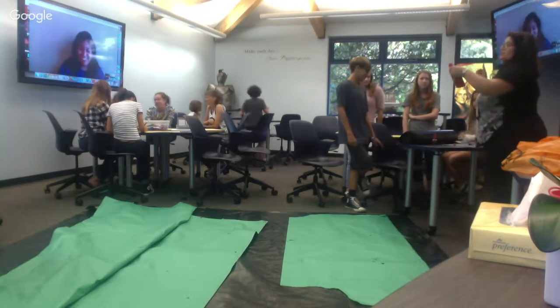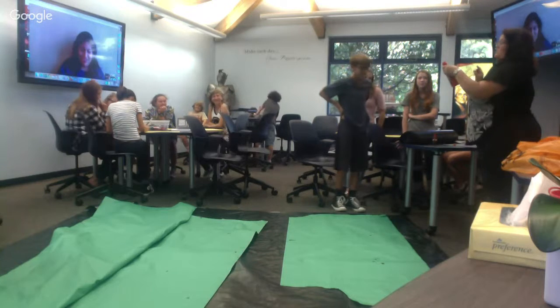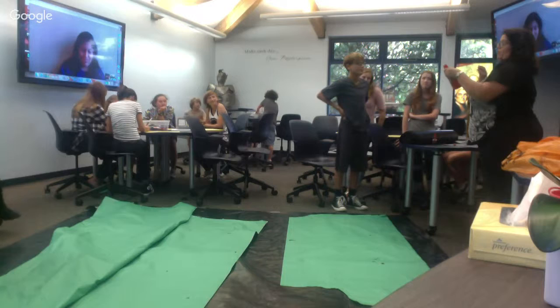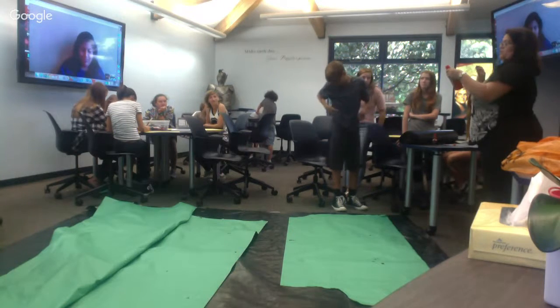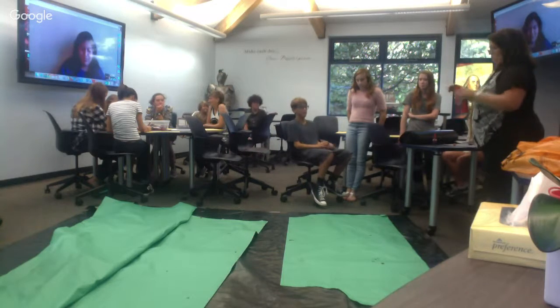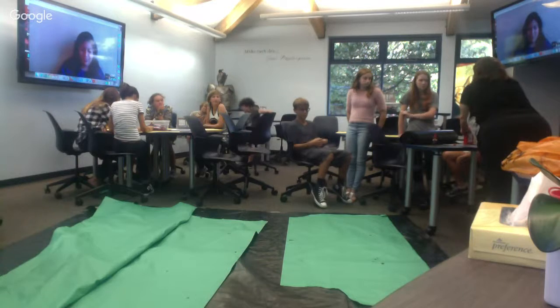Okay, listen to me. In case the blood temporarily stains your skin, if you get it on, do not rub. The stain will fade with repeated gentle washing. Blood may permanently stain certain surfaces, fabrics, and carpeting, so be careful. So, I'm going to go one at a time. Well, we'll go table to table.